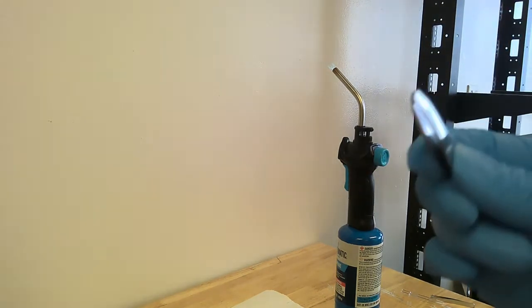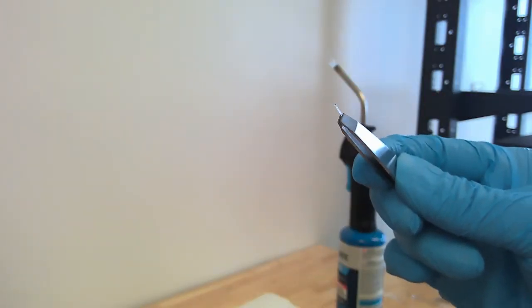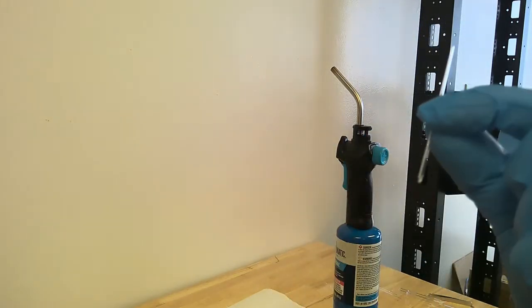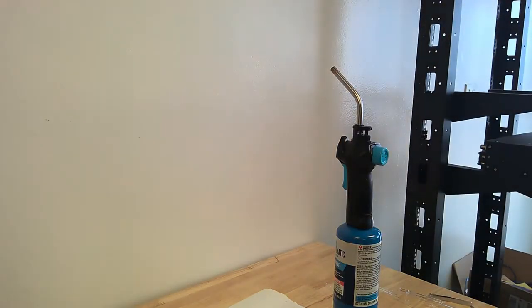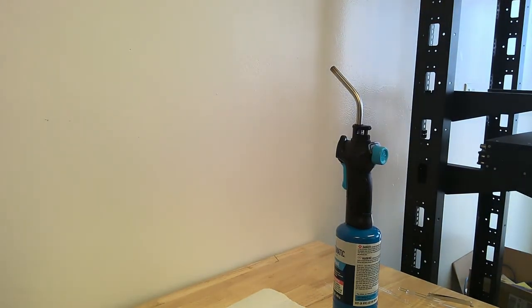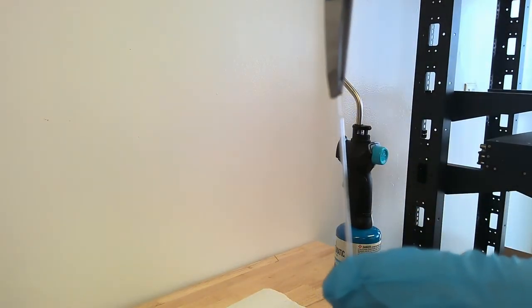Okay, so we've sealed off one end of our capillary bell. And just to show you how this all fits together, I'm going to show you how this capillary bell fits inside the microscale capillary that we prepared earlier. So we have our sample melting point and boiling point capillary. Now what you're going to do is take the capillary bell with the open end pointing down, and you're going to slot it into your capillary tube.